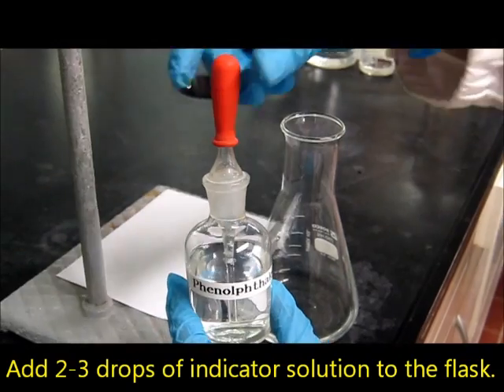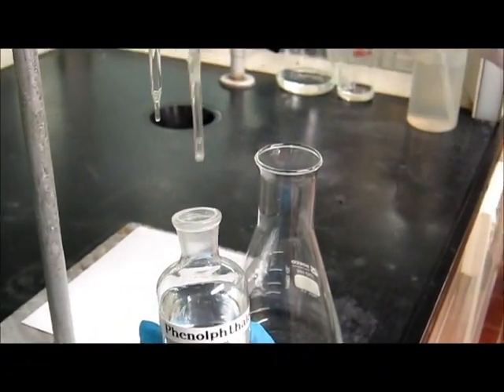So first of all, add 2-3 drops of indicator solution to the conical flask that you have prepared.